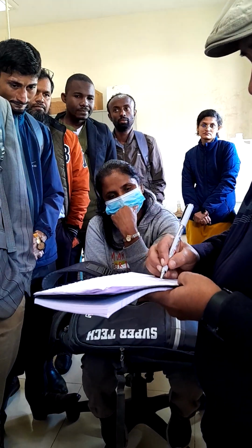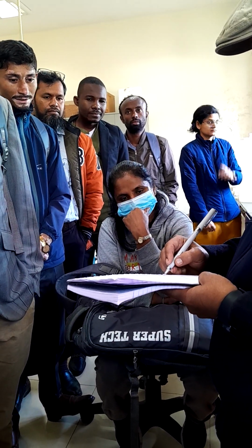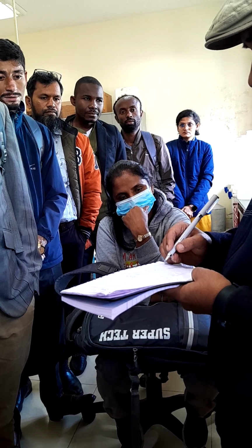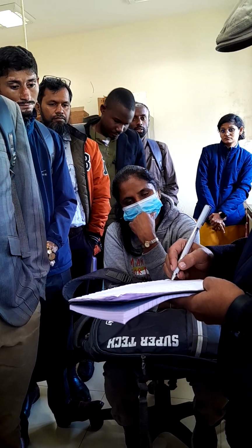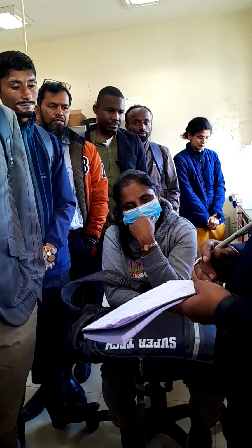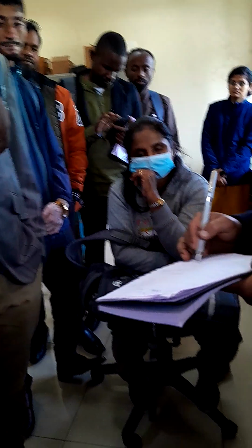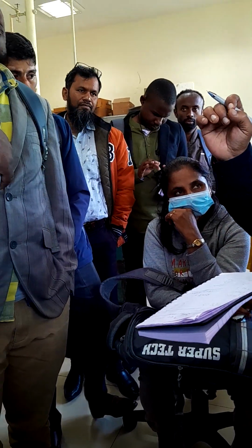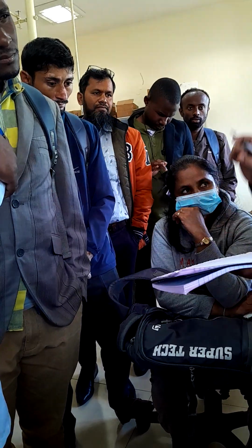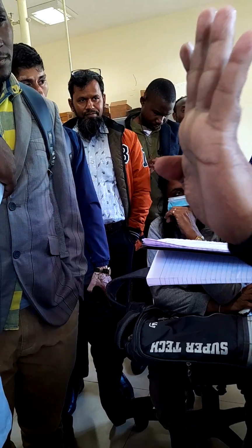The residue should not be more than 2%. Loss is always 1, not more than 1. Residue remaining should not be more than 2%. If the residue is more than 2%, think: while you are taking 100 ml of sample, you are left with 2% residue.